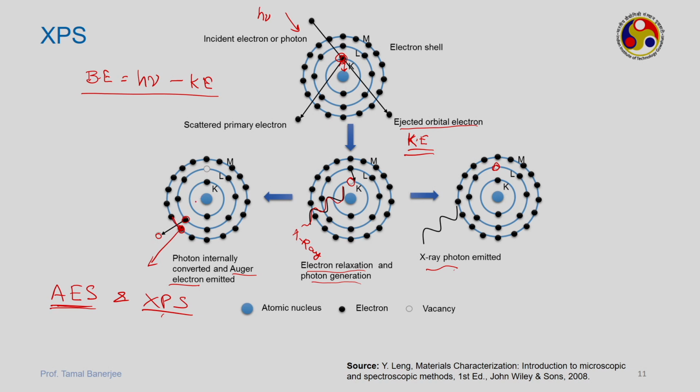So, now after ejection of this initial electron, the X-rays produced can rip off an outer electron. These outer electrons in no way depend upon the input energy. So, that does not depend upon the external energy, but the internal energy. So, this we will be looking up, the Auger spectroscopy. Auger spectroscopy is also useful along with XPS to identify the total chemical composition.